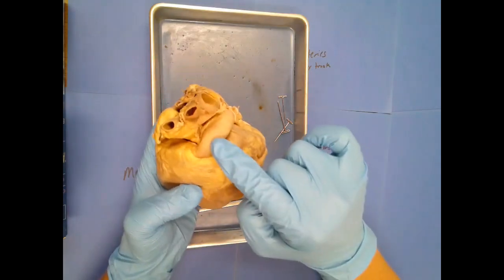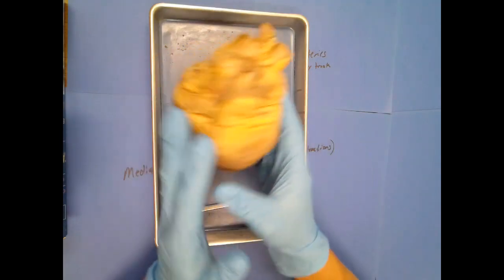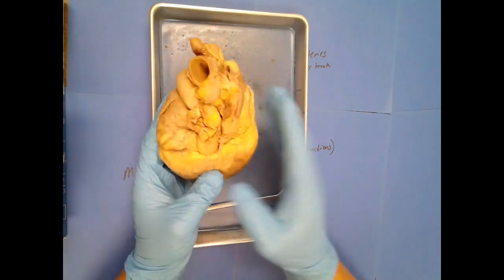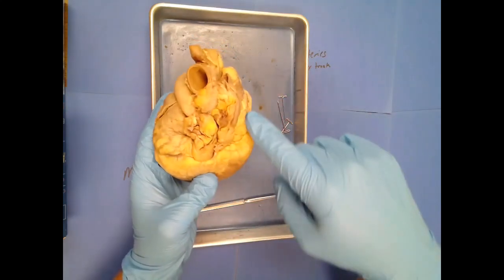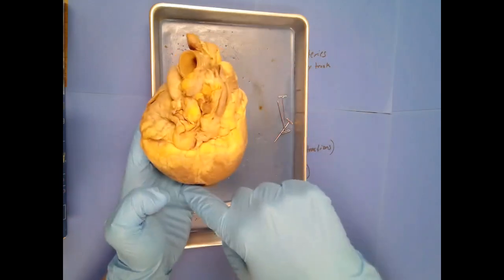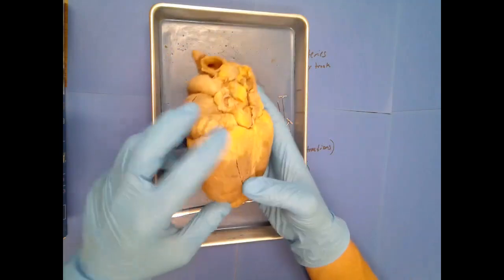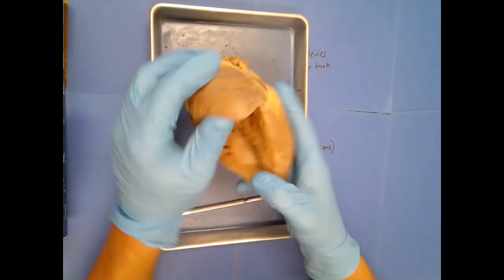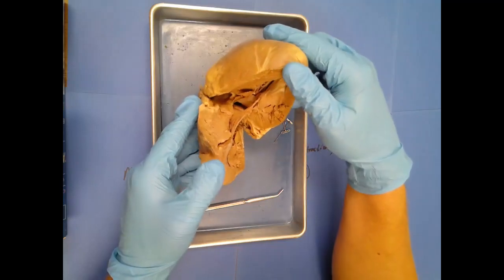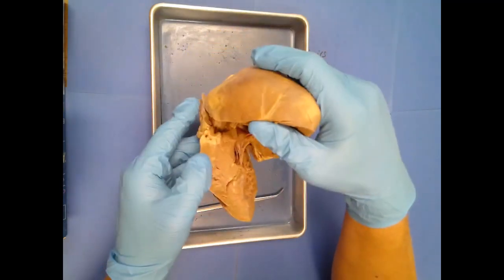If we flip this around and look at it from a posterior perspective, you can again see the right atrium, the left ventricle, and the right ventricle. They cut this in a way that you can see the left ventricle quite well, but the right is not as exposed, so we're just going to leave that be.